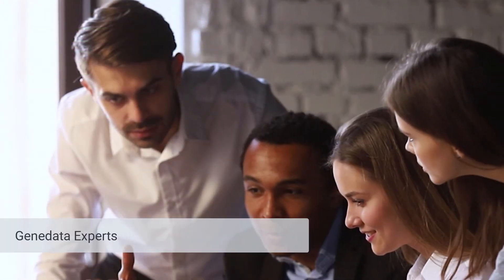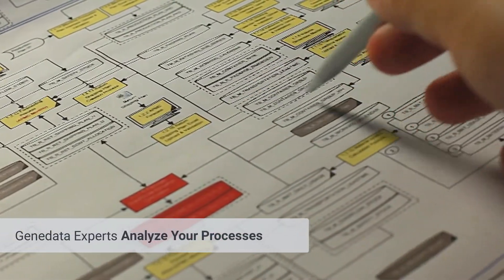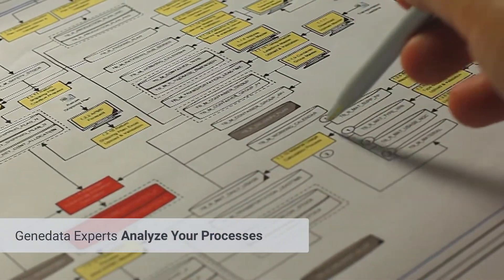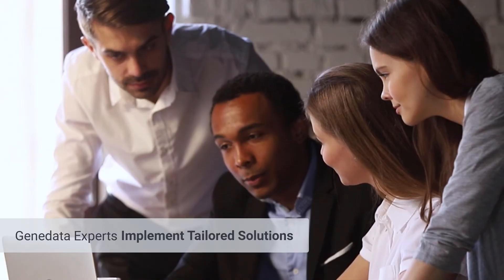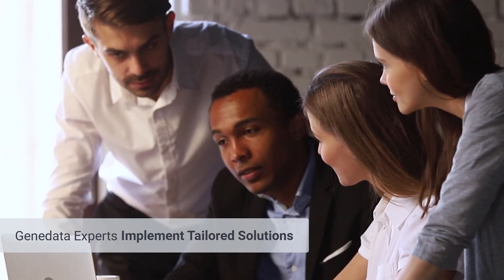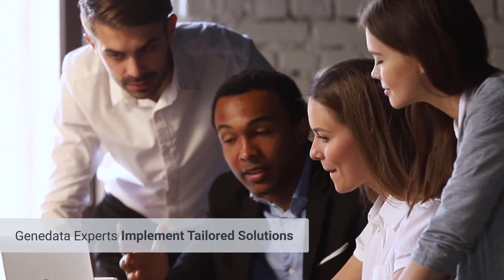Genedata experts analyze your data processes, assist in identifying bottlenecks, and implement tailored solutions to specifically address your requirements.